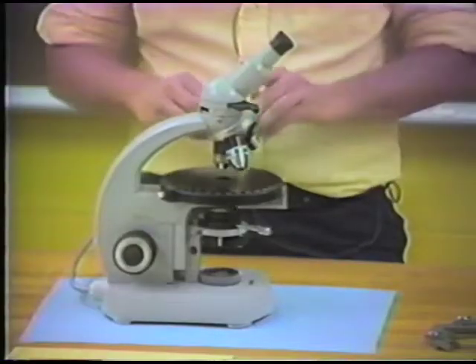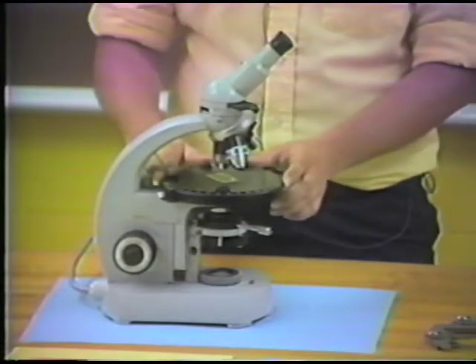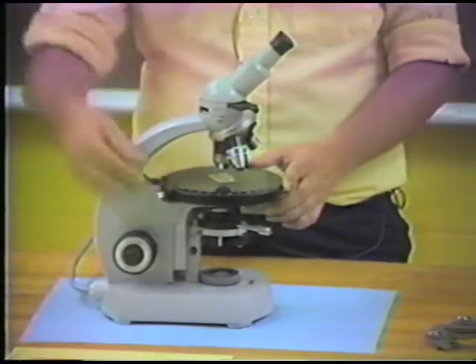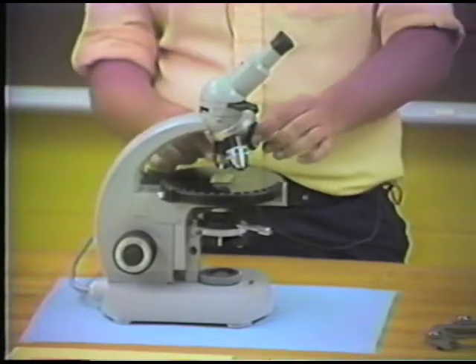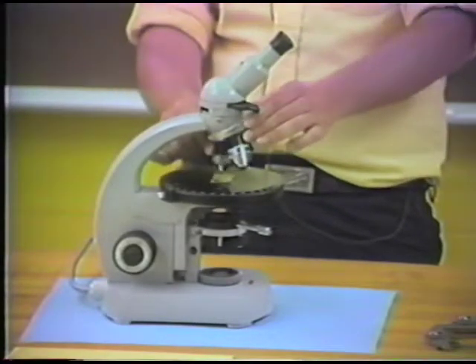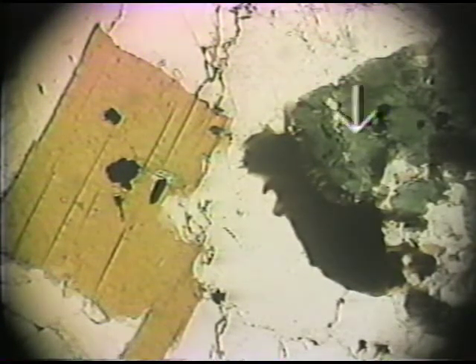We'll take a thin section, put the thin section on the stage of the microscope, and take a look at this thin section using our medium power lens. Now this is a specimen of granite taken in thin section, and if you look closely you can see grains of biotite and hornblende.